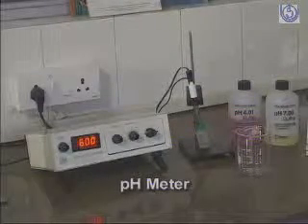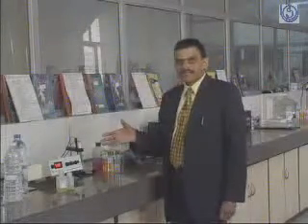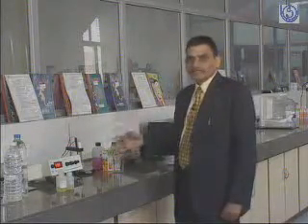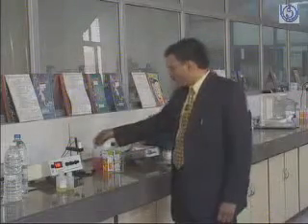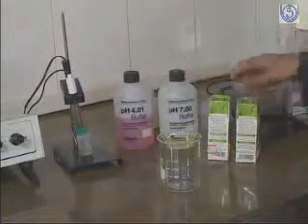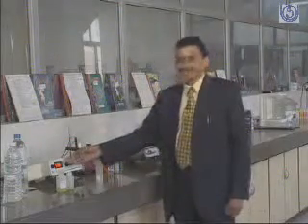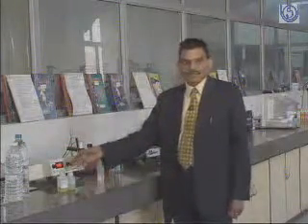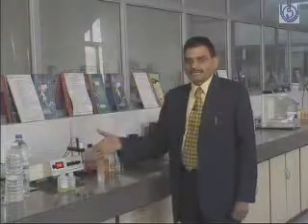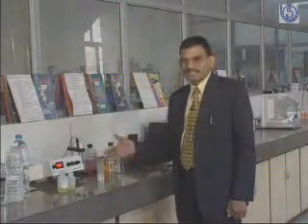Now this is the pH meter, where we can estimate the pH of any juice, water sample, or any liquid sample. First we have to calibrate this equipment with the standard pH 4 and 7. We take the sample into the flask, and then we get the pH, and the digital reading comes directly onto the equipment, and we can note the reading. If the pH is below 7, it indicates it is acidic. If the pH is more than 7, it indicates it is basic or alkaline in nature.